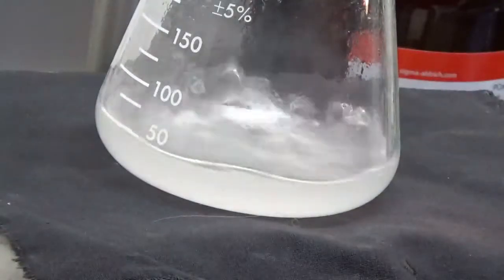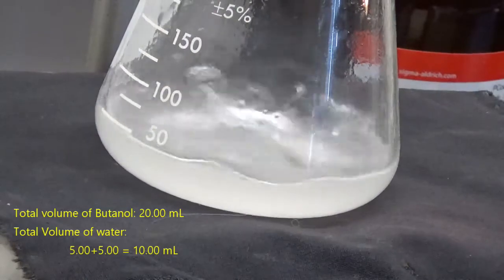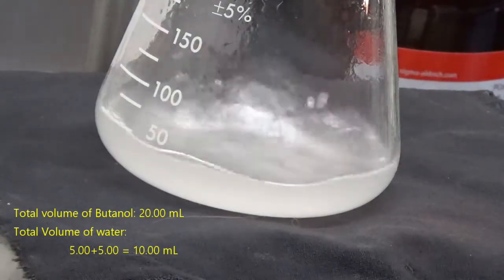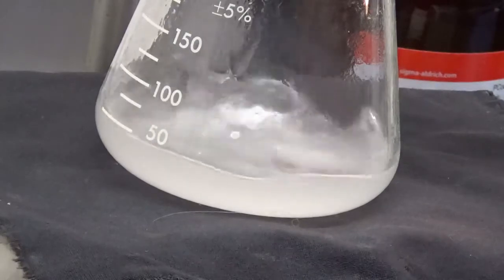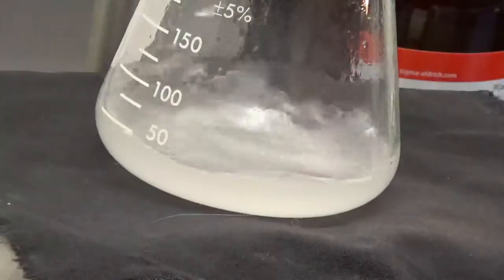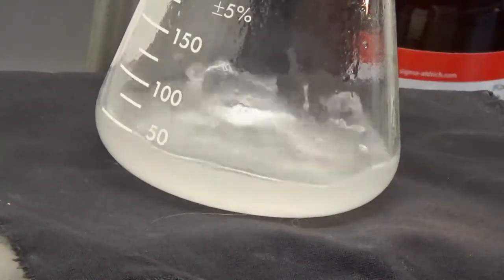Okay. So now I know that I was at 1.14. That's my initial volume for this one. Just putting drops in. Alright, so I'm going to put in a little bit. See, put the light out. It's still dark. I mean, it's still cloudy. Put some more in. I don't know if you need that light off because I can see very clearly that it's cloudy right now.